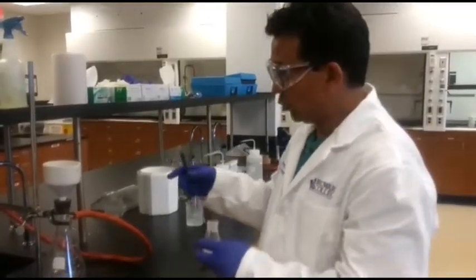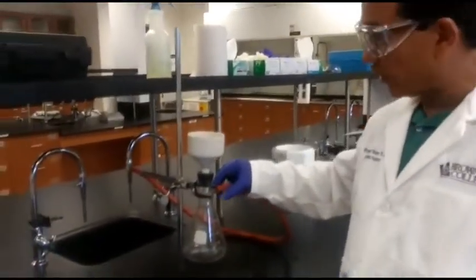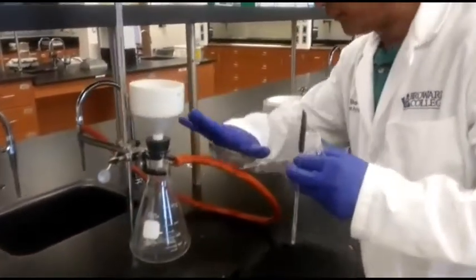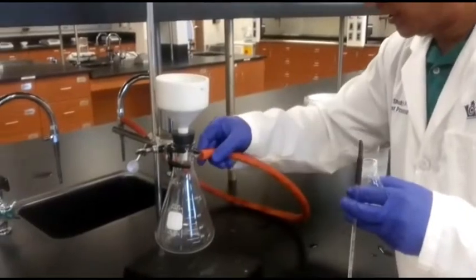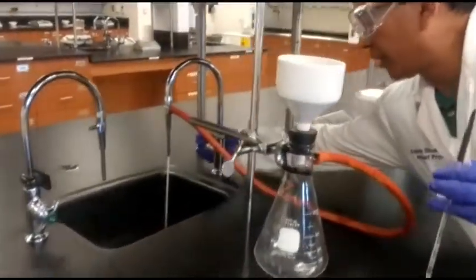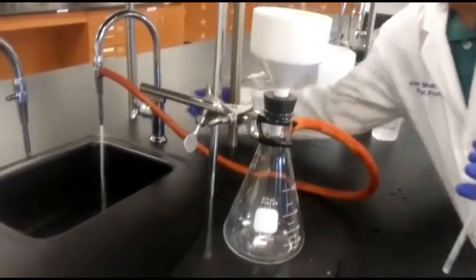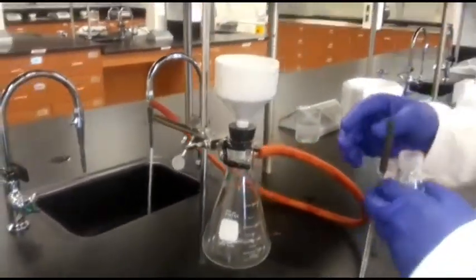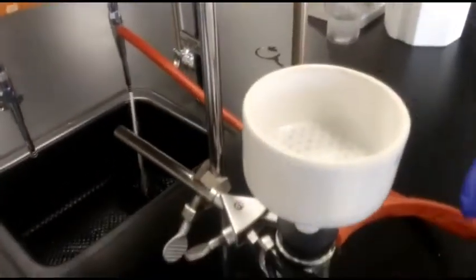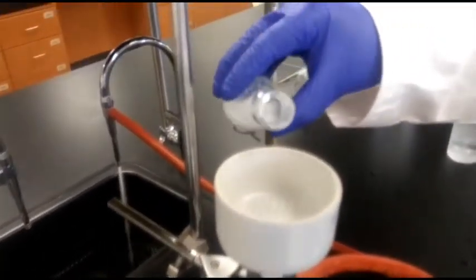Now this solid we will collect by vacuum filtration using the Buchner flask. I have secured the flask in the utility clamp, and it's ready to run the vacuum filtration. I have set up the small filter paper, and it's completely set. So this is what I will pour here.